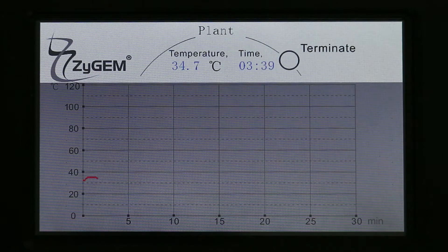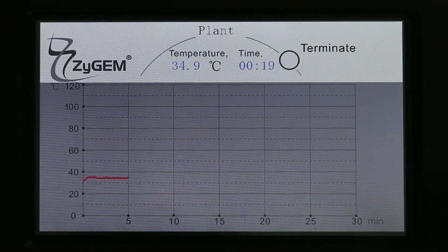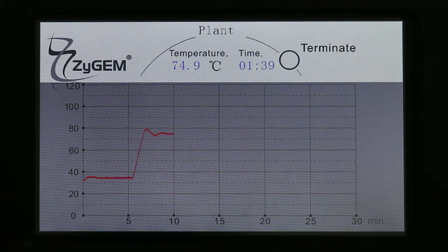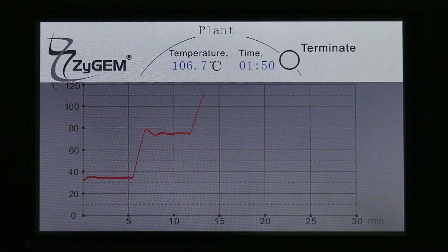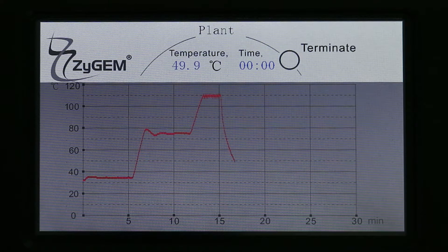Once the program has started, progress can be seen on the screen. Programs take between 5 and 20 minutes. For plant leaves, your samples will be ready in about 15 minutes.